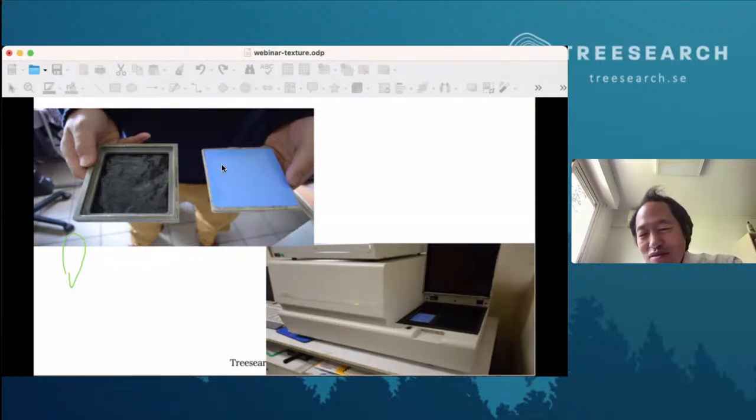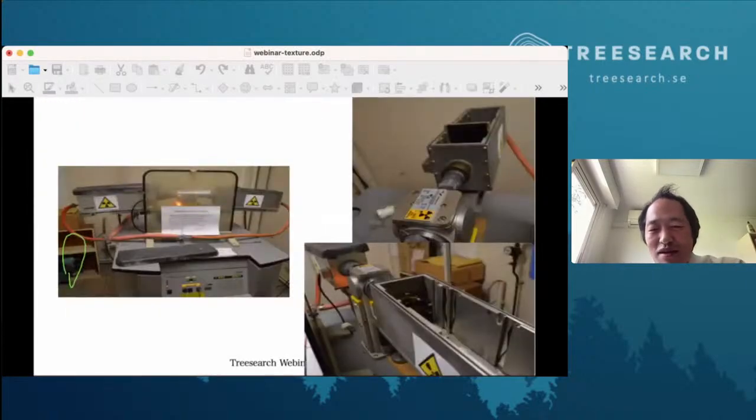But the advantage of this is that it's very low price. Each plate is about 100 euros, and you can use it many times. And this system has been working for 25 years without any problem. So it's very robust and maintenance free. So that's why I like it. If you buy a detector, you have to invest a lot again in the maintenance. And here it is something that is really simple, that is robust over a century. By the way, the camera I've shown here dates back, this is brought from the United States in the 1950s, and it is still in use because it's just a camera that you can pump in vacuum.